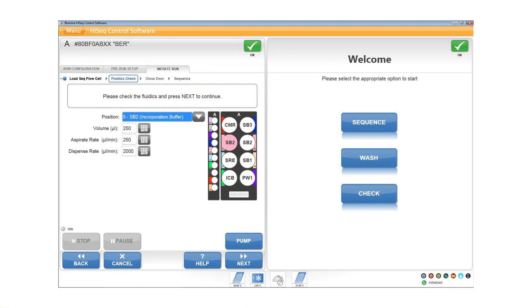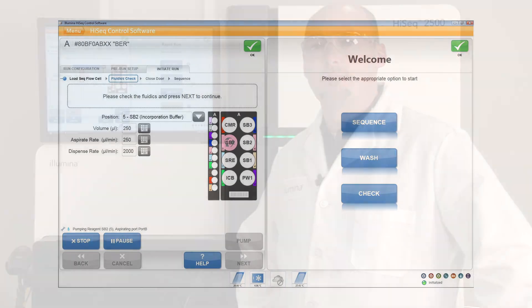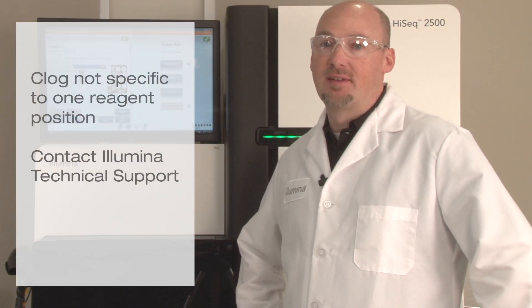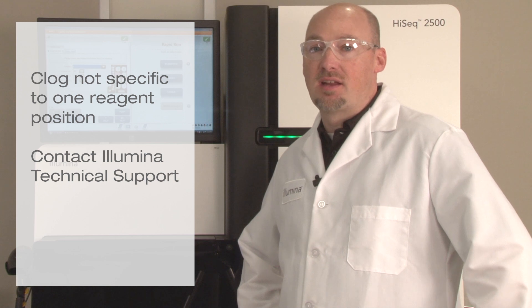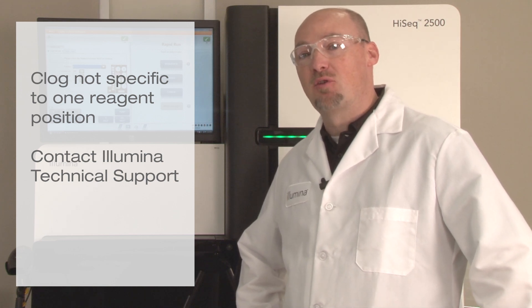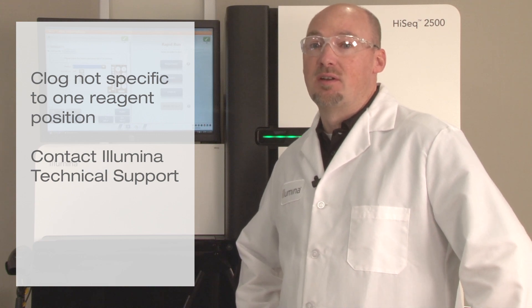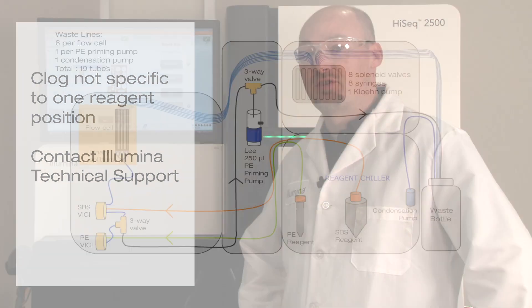Next, change the reagent bottle position in the flow check settings. If the issue is specific to the line from reagent position 5, for example, then reagent position 6 would not be affected. If the clog is not specific to one reagent position, then the blockage could be in an internal valve or due to improper front or rear manifold movement. Please contact Illumina Technical Support to schedule a service visit for your instrument.